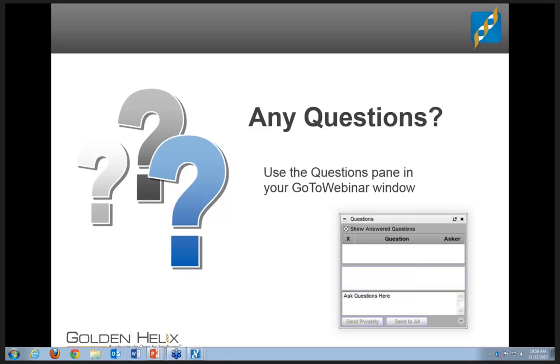Going on to the next question, does GenomeBrowse only take VCF or BAM files? And can you look for RVs if you only have a CSV file of genotype data? So GenomeBrowse itself, the free version, is designed to look at VCF and BAM and bed files as the primary inputs. If what you have is just a CSV file, I assume it's just some kind of tabular representation of genotypes, we would probably need you to either get SVS and import that as a spreadsheet and then view it through SVS, or maybe we'd have to figure out another way to do it. But no, I don't think it directly will read anything from CSV.